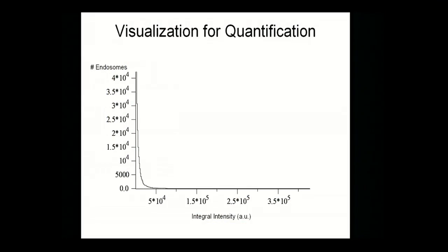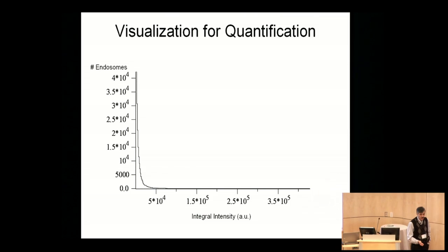And they show in reality that they can find the endosomes. They work with the same Rab5 endosomes with much higher accuracy, with subpixel resolution. So at the moment, these are the only two approaches which allow quantifying in a good way high dynamic range images like endosomes, which are sub-resolutional. OK, we quantify it, and now I switch to the next topic.